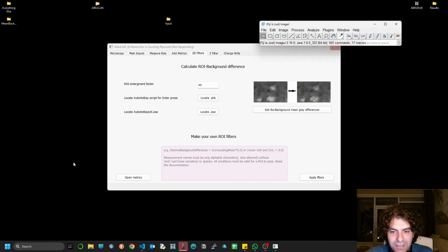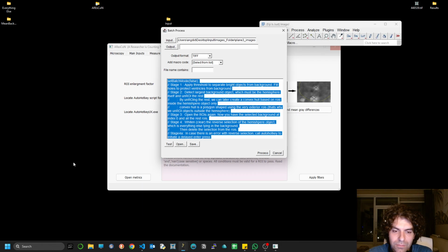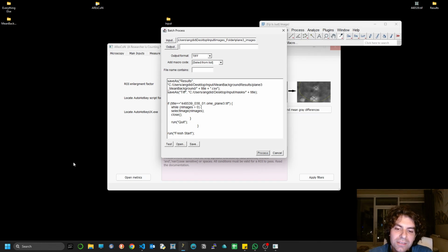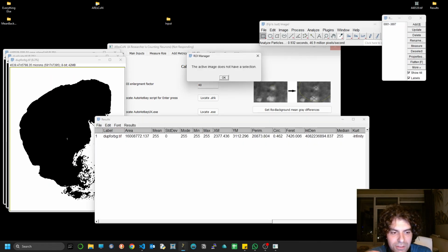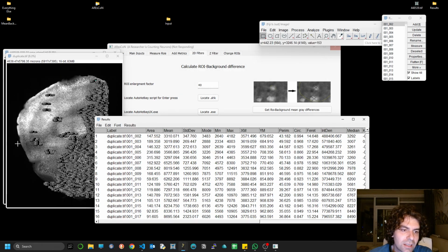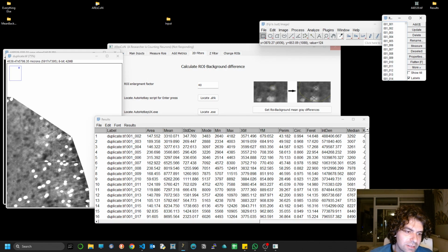Let's go for plane 3. And as I told you, this is close to the final step, the penultimate step, I would say, for those who are working with one plane. So let's have a look again at how the image looks. Now we're at plane 3. The error, as always, AutoHotkey intervenes, it presses enter, and the convex hull will be created along these lines. Here's the convex hull, and it helps, as you can see in this scenario, right?